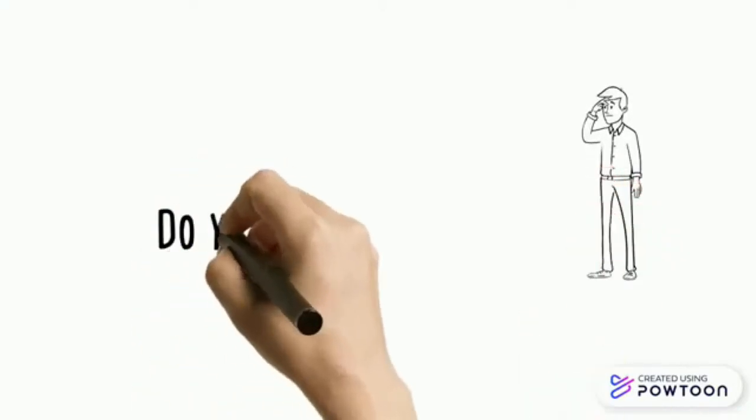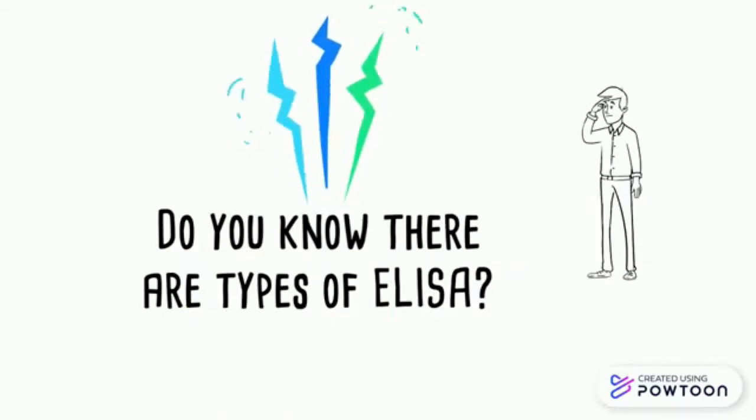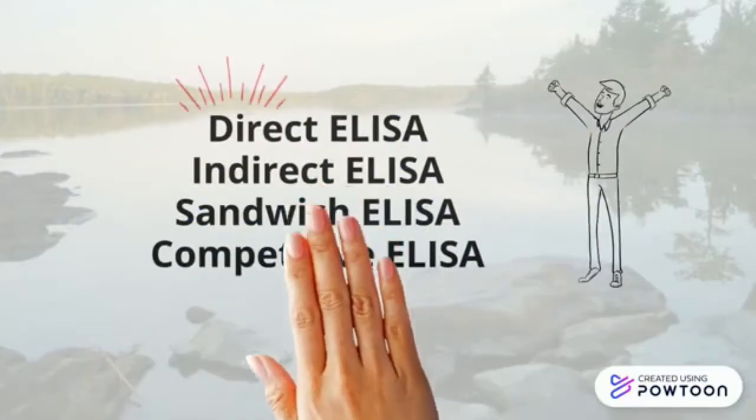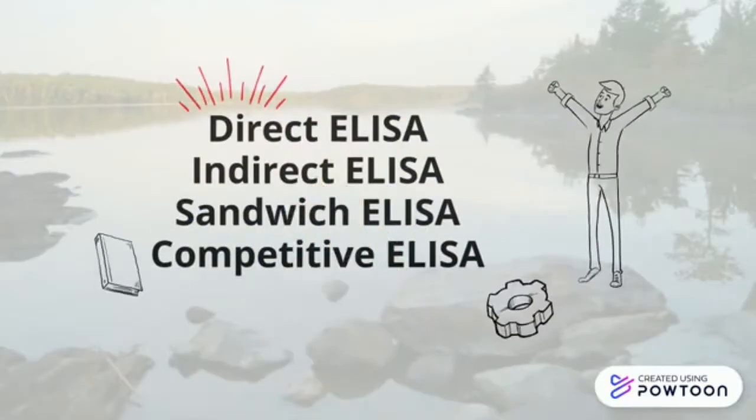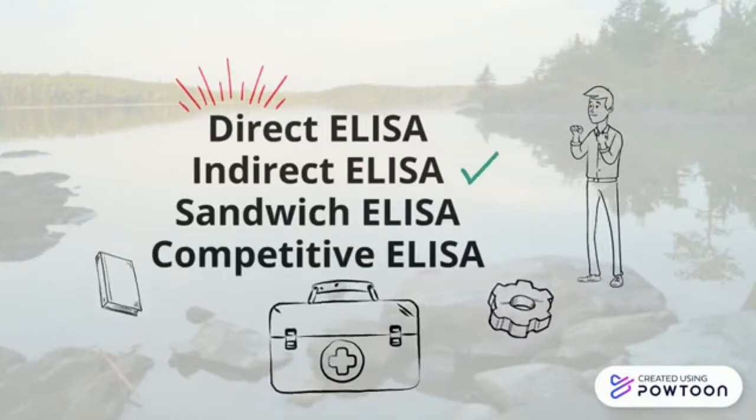Do you know there are types of ELISA? ELISA. There are direct ELISA, indirect ELISA, sandwich ELISA, and competitive ELISA. And we will be talking only today about indirect ELISA.